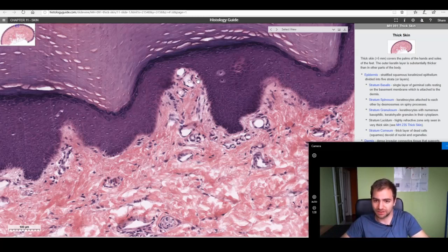So exactly beneath this area of the loose connective tissue, we can find the dense connective tissue. This is the reticular layer. In the reticular layer, we're going to find the same cells, fibroblasts, fibrocytes, and the same thing. But the difference is that in this case, the density and the amount and the mass of the collagen is way higher than that of loose connective tissue. Besides this difference, there is no other specific functional difference of contents.